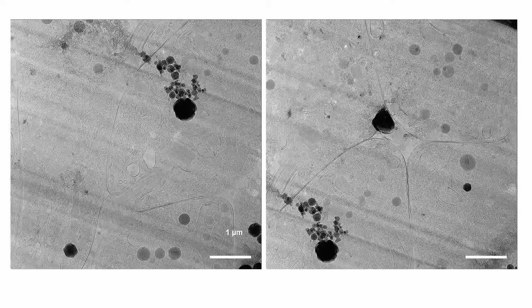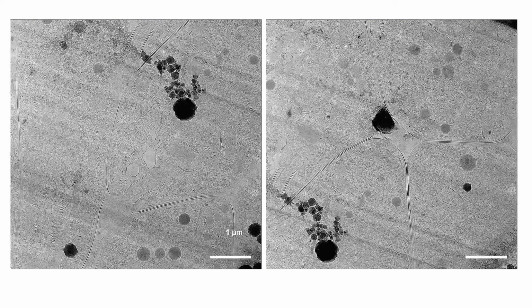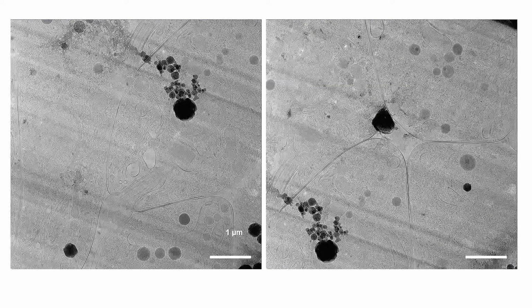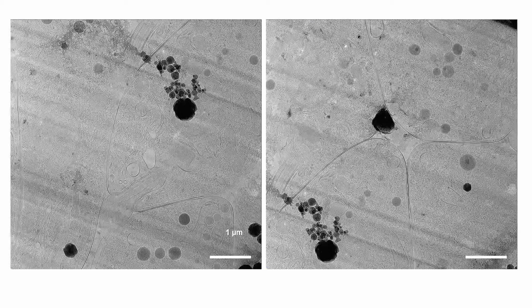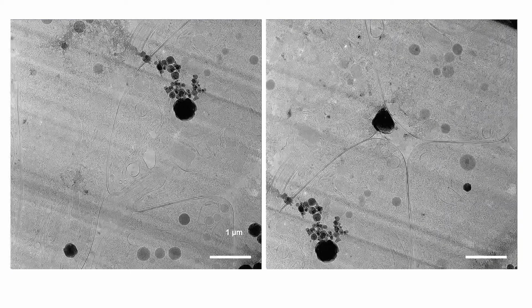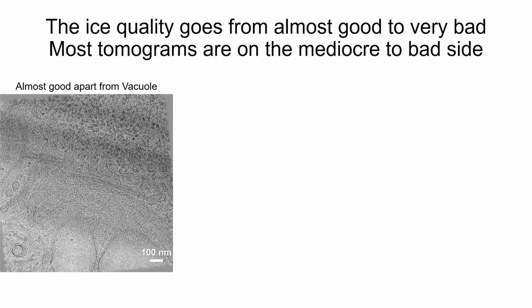And then we started to pick up important regions, the regions that I was interested in, most of them in the anterior part of the parasite, that is where the cytostome-cytopharynx should be. So we made many tomograms. I think we made more than 50, right? Tomograms during my stay there, something like that. It was a lot of them.